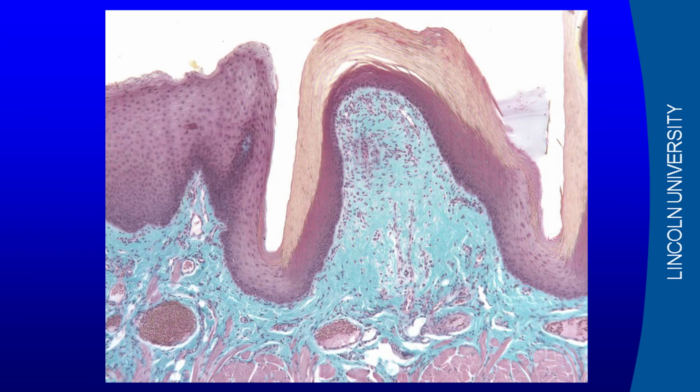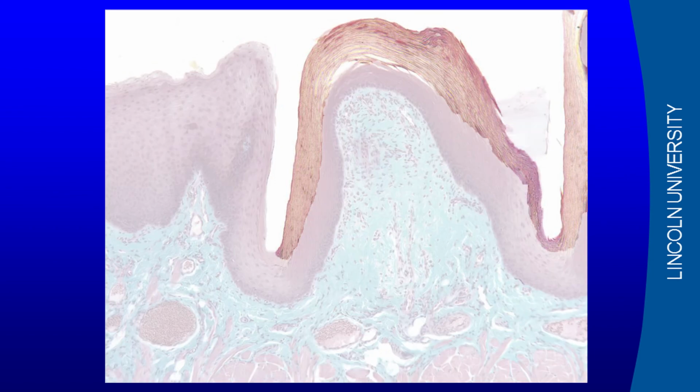And when looking at those nuclei, that gives you some idea of the number of cells that are in that skin layer, because you can't see the membrane surrounding the cell. So the only way with a light microscope that you can tell how many cells are in that tissue is by the number of nuclei, and that gives you a rough indication of the number of cells. So on this fold of the tongue here, you can see this yellow stained material, and that's that keratin. So the keratin has been secreted by the cells in the epidermal layer here and is covering the upper surface of the tongue there and giving it that tough protective layer.